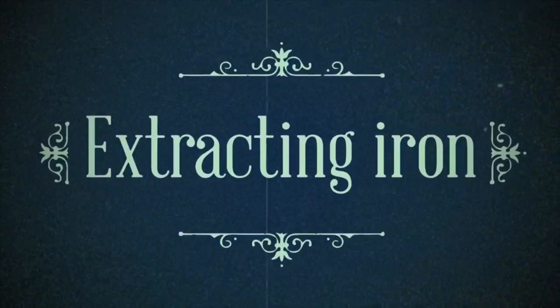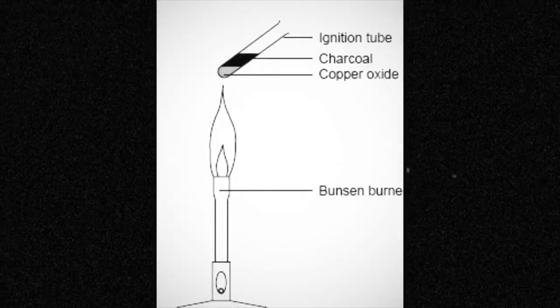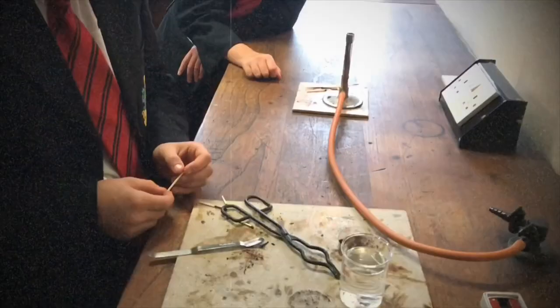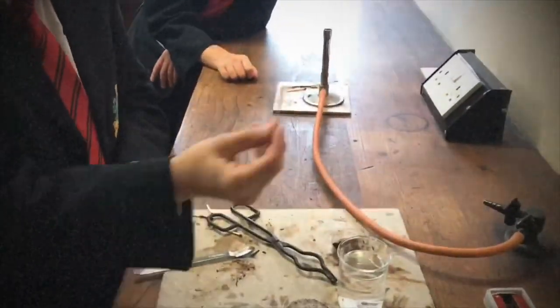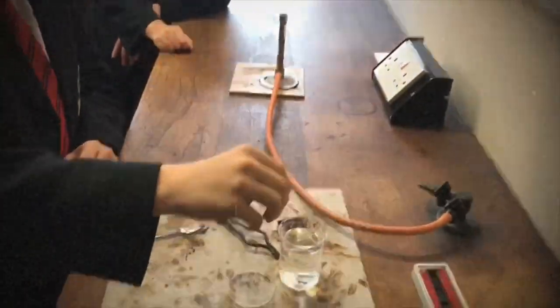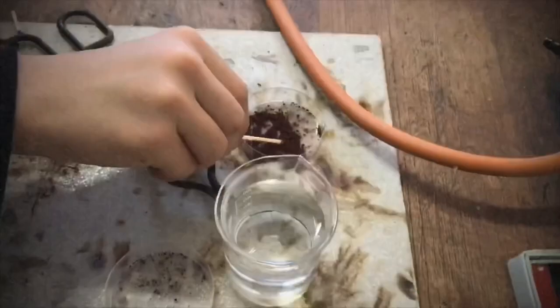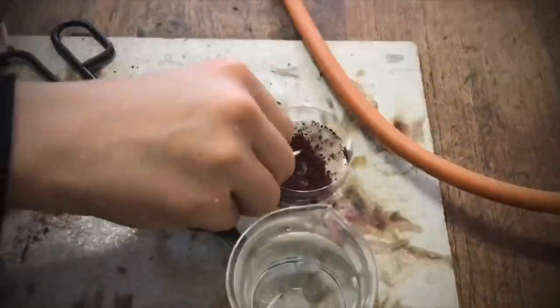Welcome to our video on the reaction of metals. We're going to be extracting iron with carbon. As you can see in the diagram, we're going to be burning the carbon using the match head. So we're going to dip our match head into some water and roll it in our iron oxide.